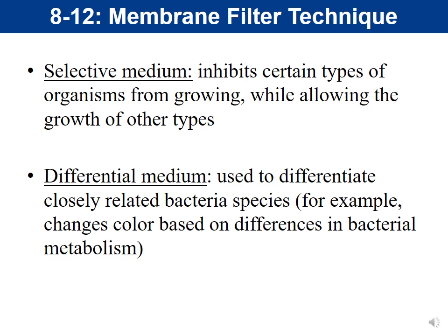We talked about this in chapter 6, where we looked at different types of media, including reducing media, and selective and differential media. Selective media inhibits certain types of organisms from growing while allowing the growth of other types.